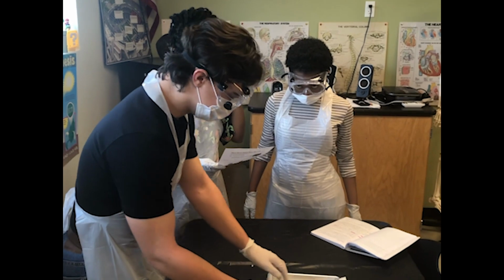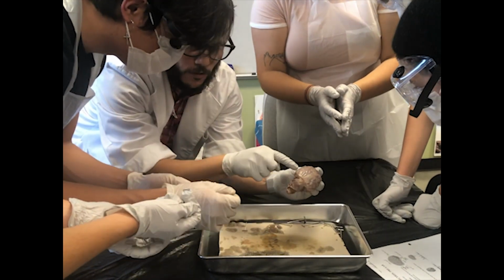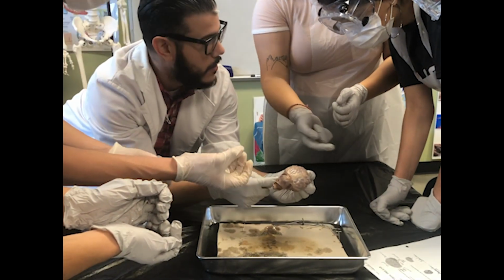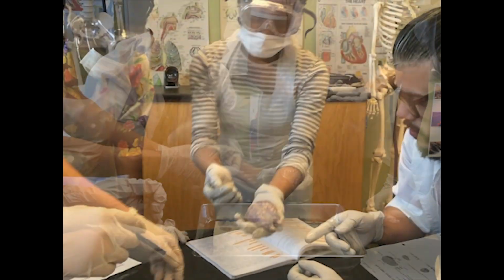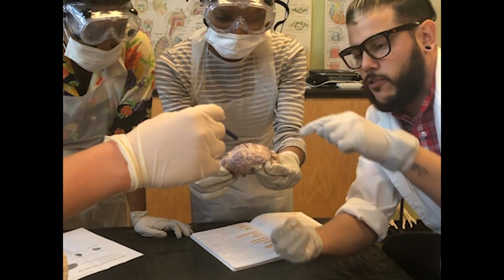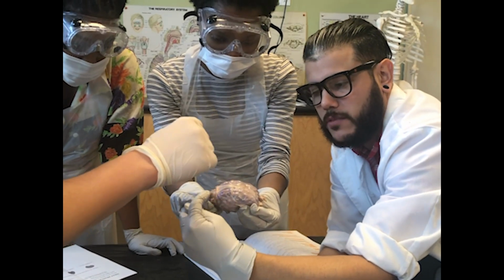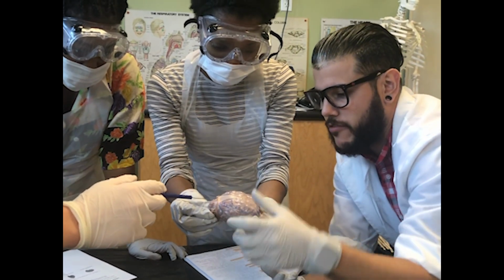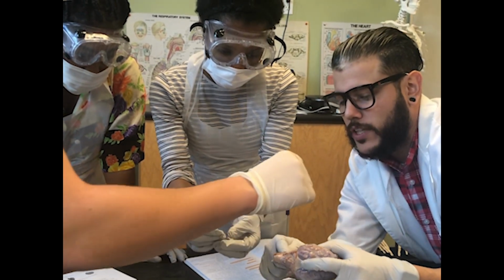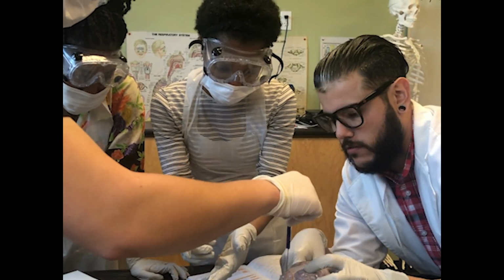Forebrain, hindbrain, midbrain. What is this? The cerebellum. Forebrain, hindbrain, and what's missing? The midbrain, where the brain starts. So here's the forebrain. You hold it like this. The forebrain is the main part, and then the hindbrain is made up by the cerebellum, and then you have the midbrain, which in theory is in the middle and makes up most of the brainstem going into the, what's down here? Well, this is the spinal cord, and here's the pons, the medulla, the midbrain.